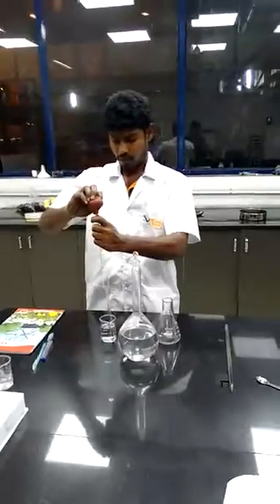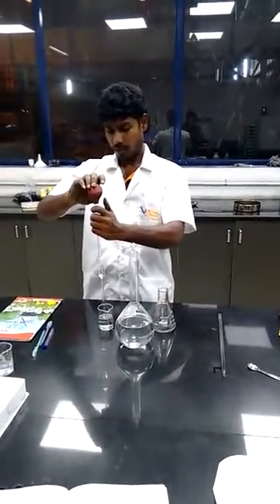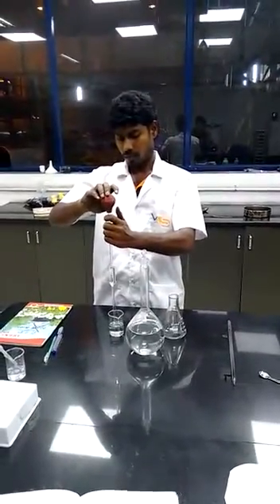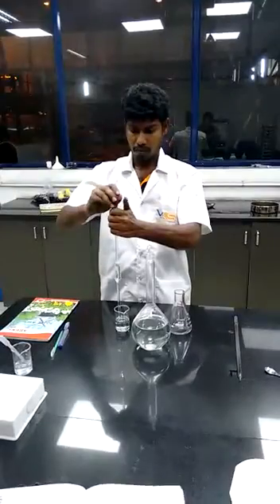Repeat the procedure two times, then average the two burette readings to finalize the burette reading.